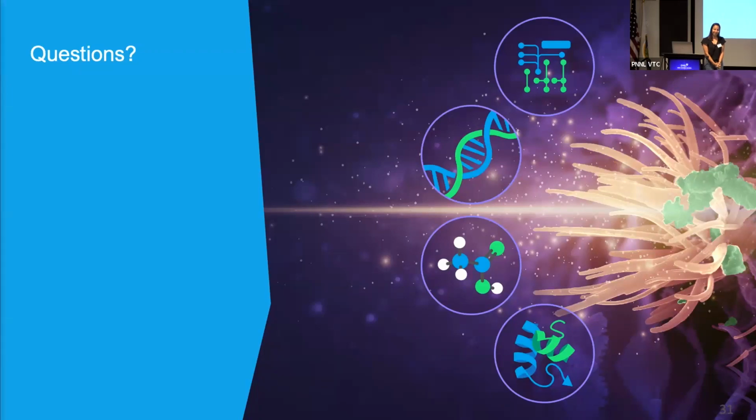Hi, I have two questions. You mentioned during the proteomics workflow, creating a reference database with more than 50 million proteins, downloading FASTA files from JGI. Did you use KBase for any of this? Because I'm just trying to understand the programs that you used for that workflow. So that was all our computational scientist. She basically did all the work. She downloaded all those FASTA files and clustered them together.